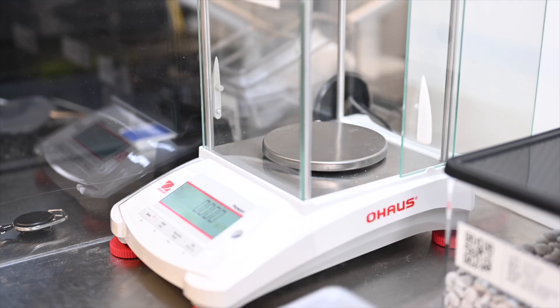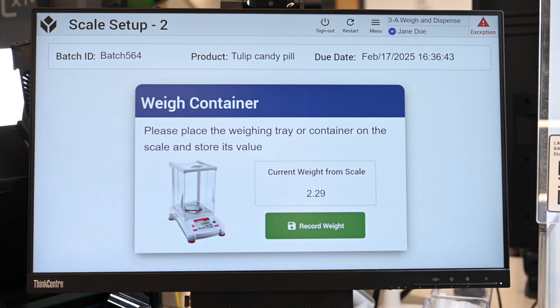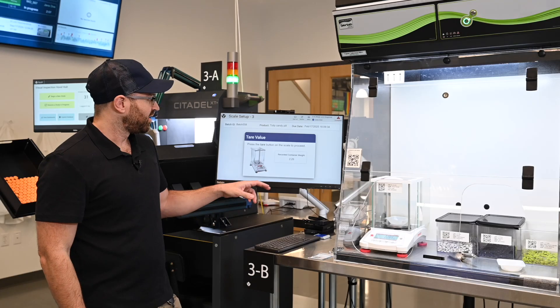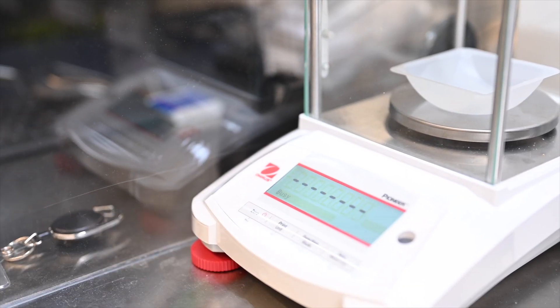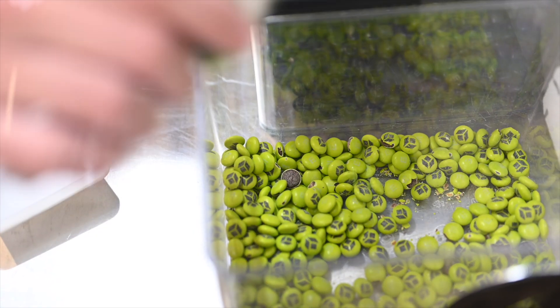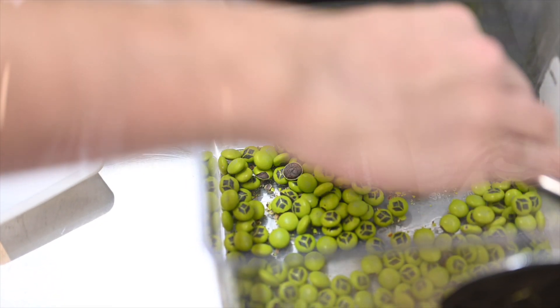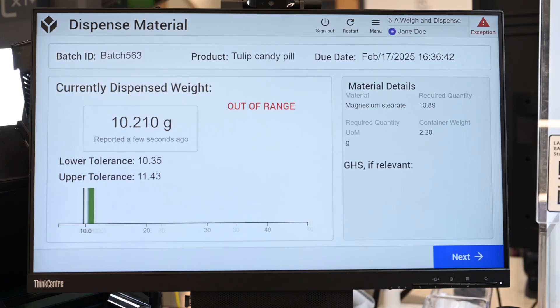Now I have to weigh the container, and I'm going to record this weight to the batch record. This will carry along with it as I go ahead and put all the material together in the batch. I have to press the tare button before I move forward. Tulip is going to recognize that it has been tared and move me to the next step. Now I can begin weighing — I'll pour these into the container, and as I get closer to the target, it's actually going to zoom in and help me get to an acceptable range.